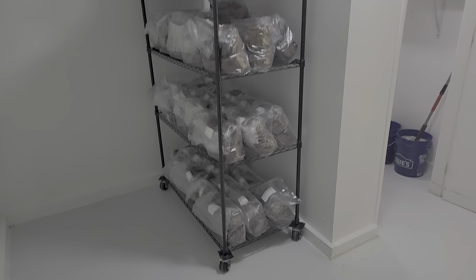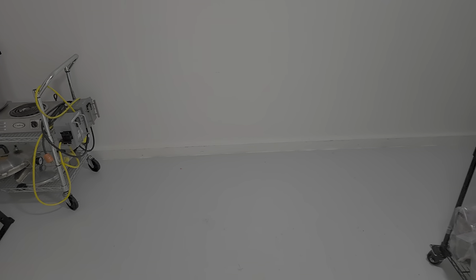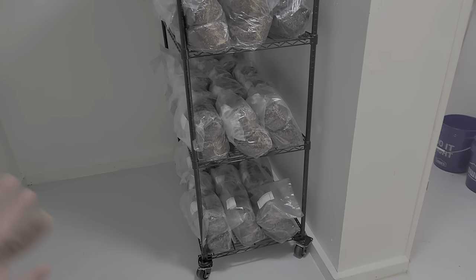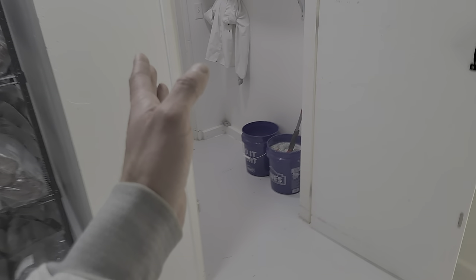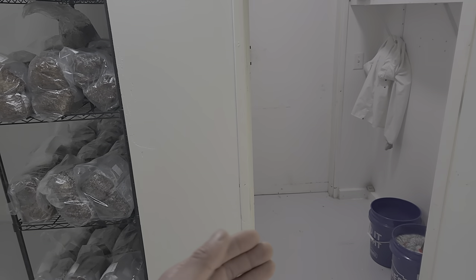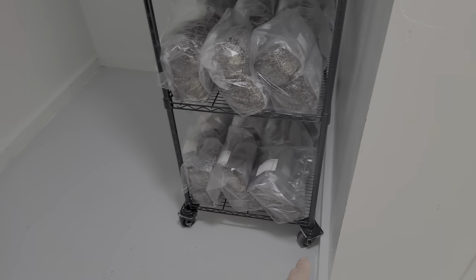From there you can see the incubation room. I don't have anything incubating right now — I just put everything in the fridge across the hall. Whenever an order of sterilized substrate, spawn, or a rack of spawn is done, it rolls out and gets unloaded into the fridge or onto a pallet. But I want to re-sanitize the rack before it comes back in — I wipe it down, clean the wheels, all of that.